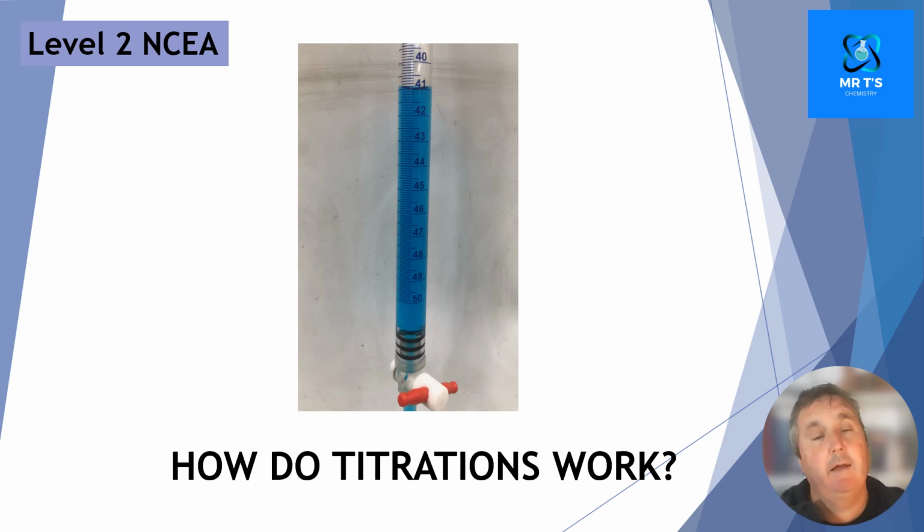This video is about how titrations work. We're going to go into the mechanics of how we see a change of color at the end of a titration. In this example, we're going to use an acid-base titration.